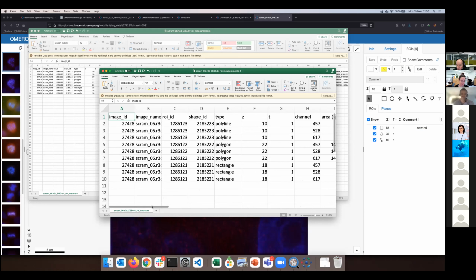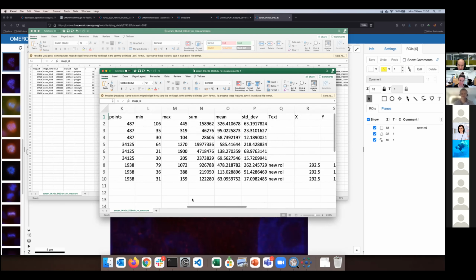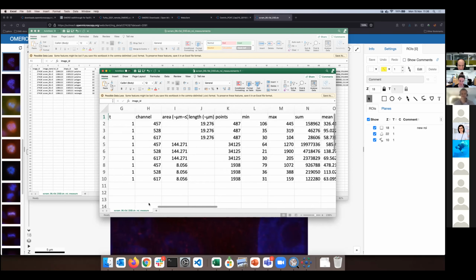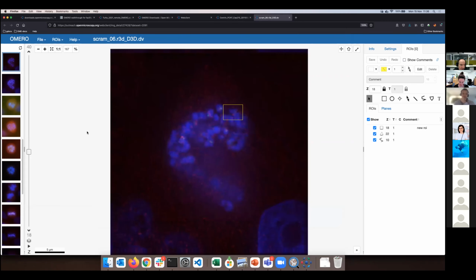I will show you how tomorrow. So you connect Fiji to OMERO, and you will define your columns, and you will have a much richer table than we do, and you do your analysis there. Of course, if our users insist that we must make this script better, then once we get to that, we probably will. But at the moment, it is as it is.